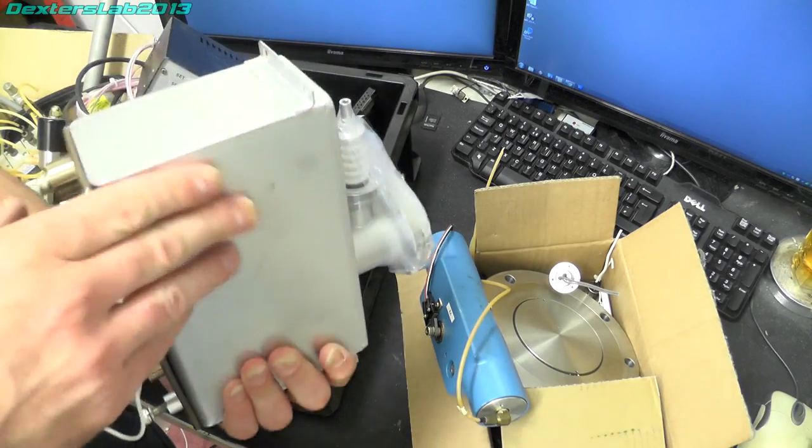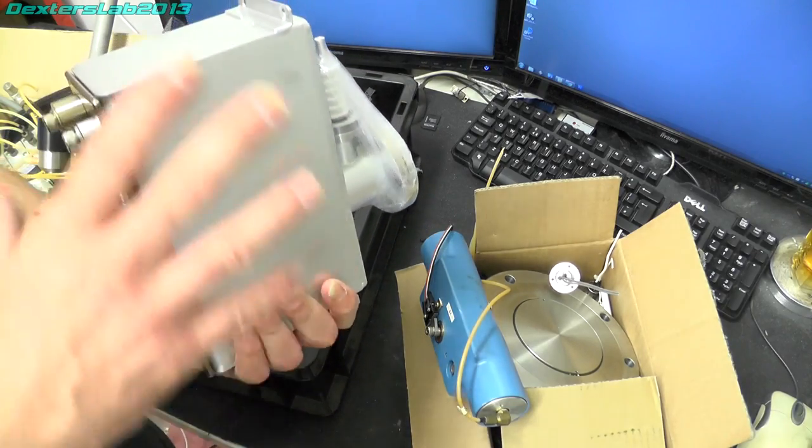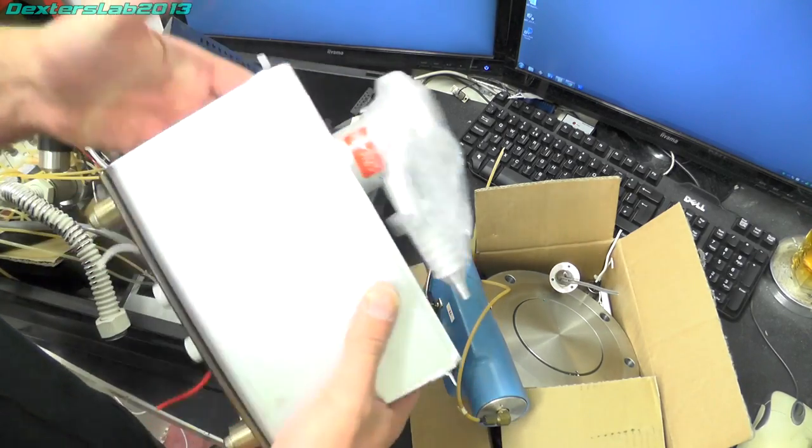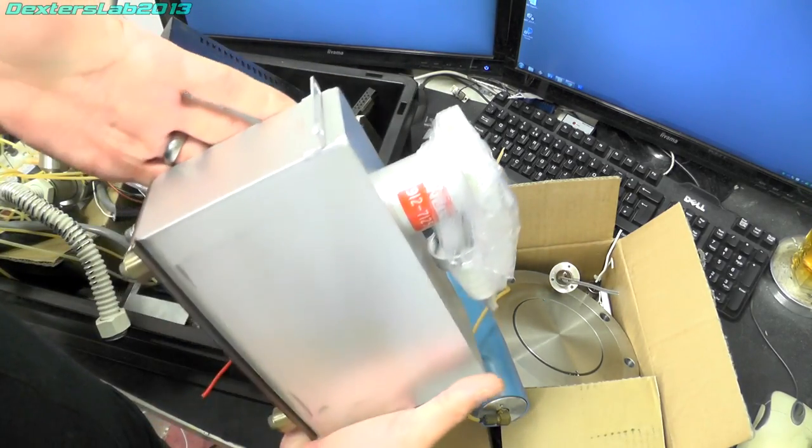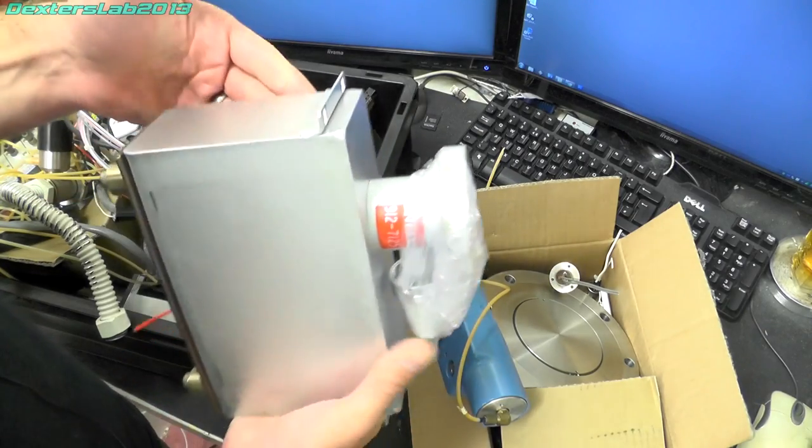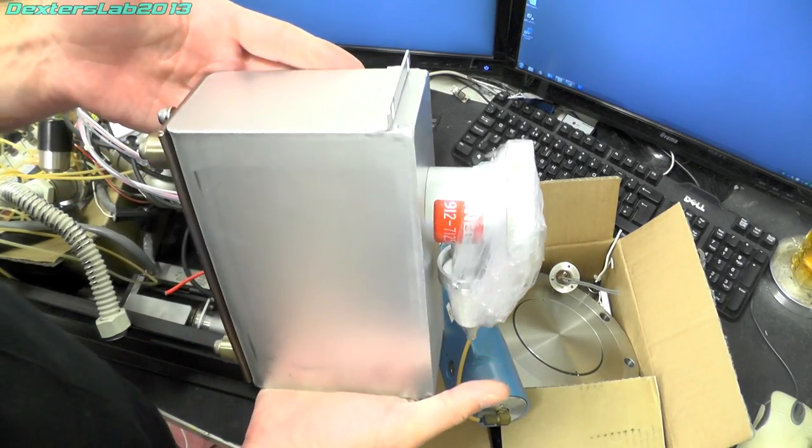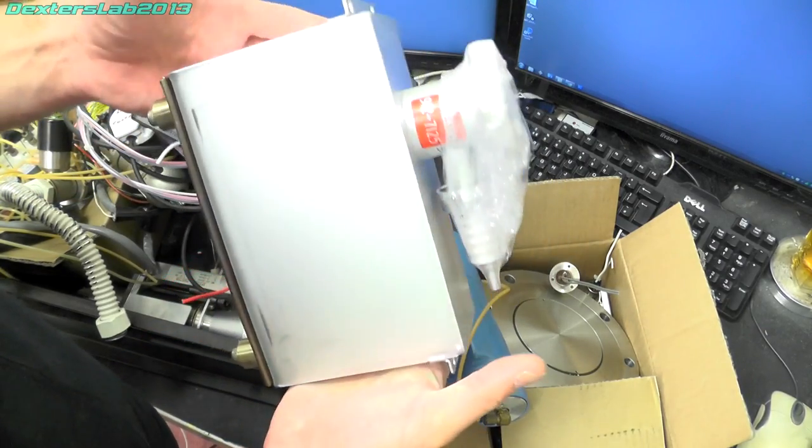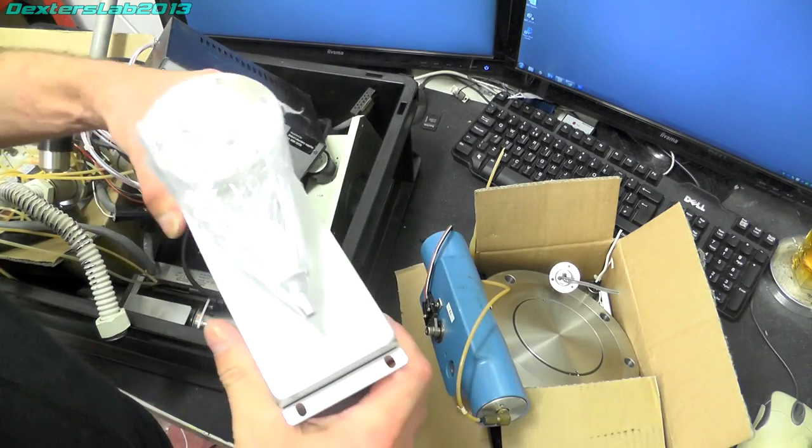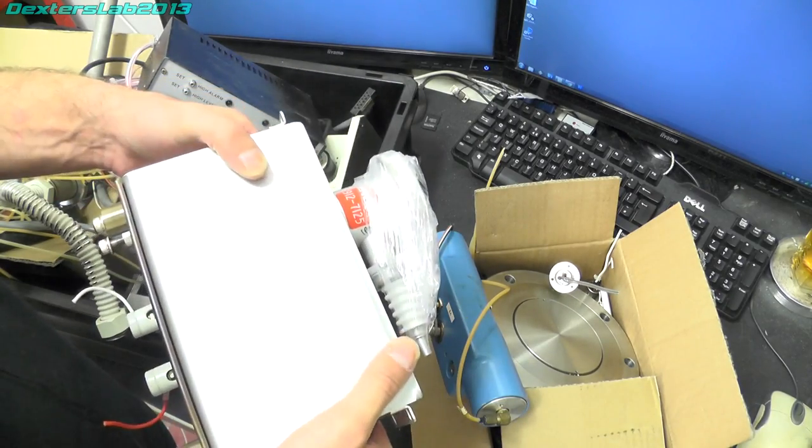I have removed the magnets that normally surround this because this is getting shipped off, I think this was going to America. So the magnets have been taken off just to make it a lot lighter.